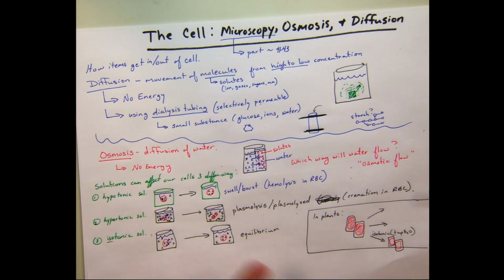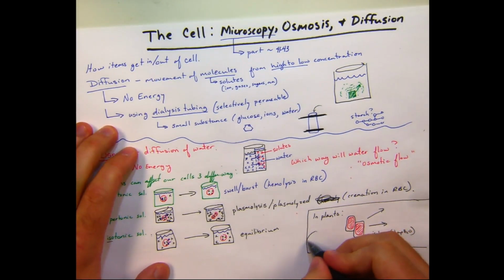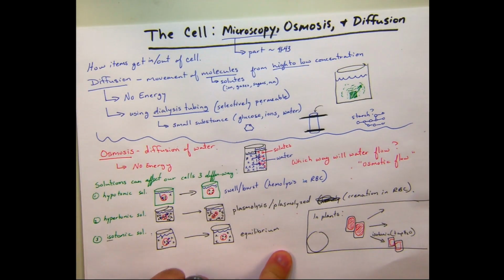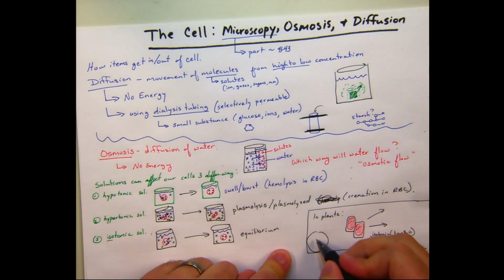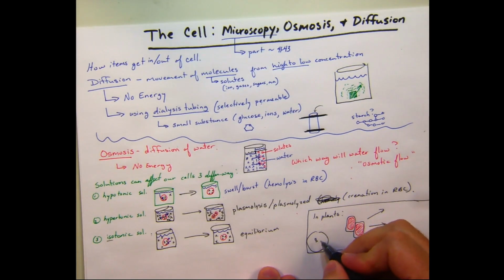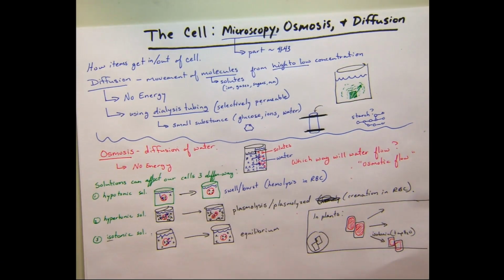Not much difference. Oh, by the way, when you're drawing this, you have a circle. A really good method of retention is drawing. When you have a circle on your lab manual and you are looking at something, if you draw a little square like this and you have to draw hundreds of them, obviously you can increase the magnification. Do not do that. That is ridiculous. You don't have to draw all of them, but you can increase the objective.